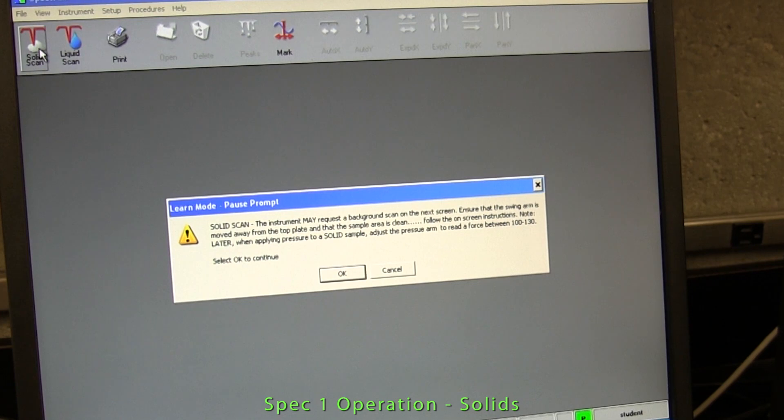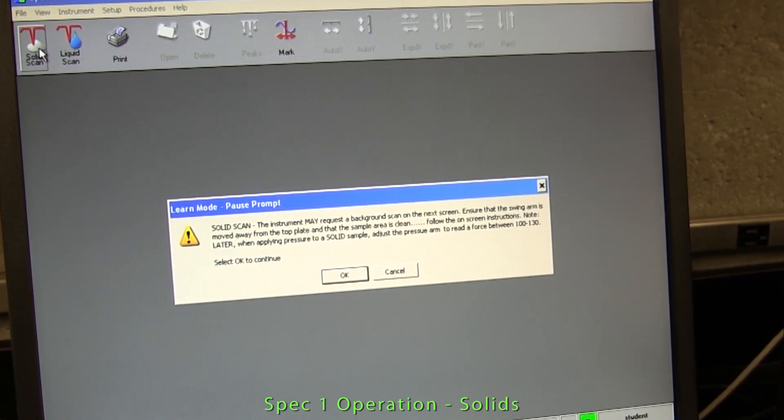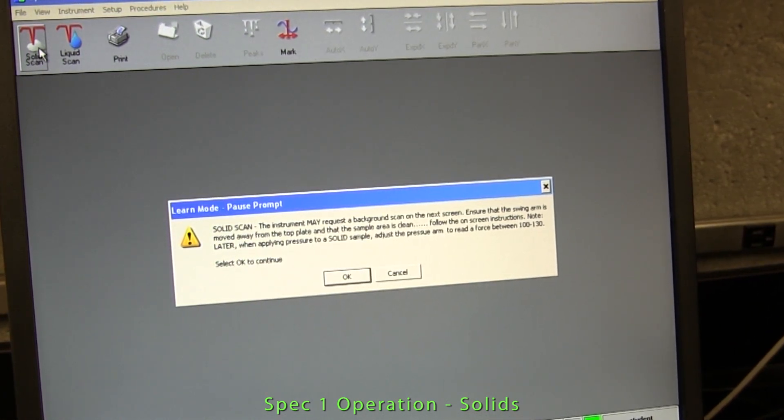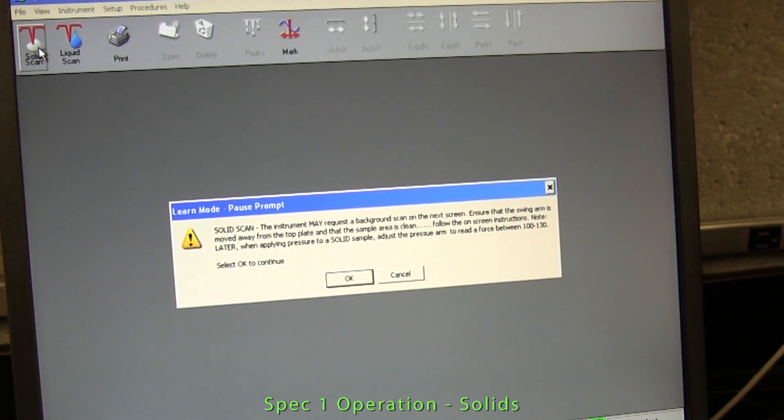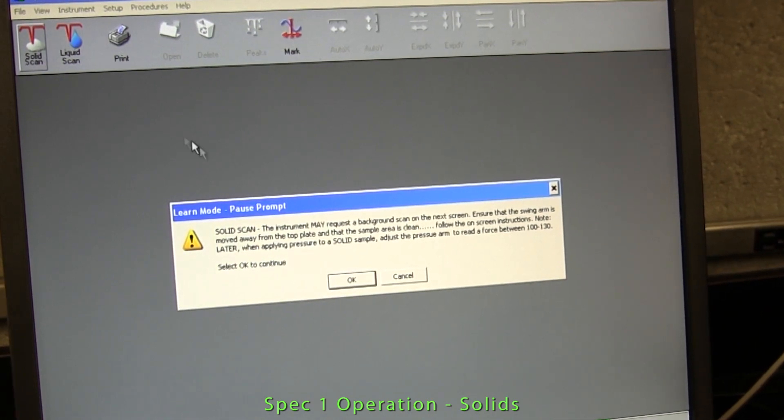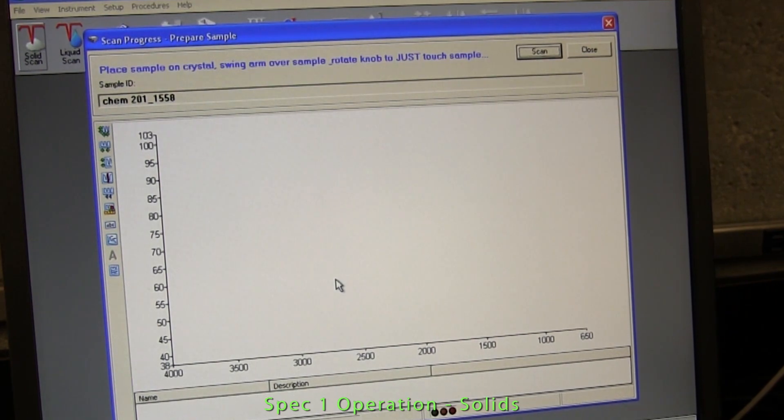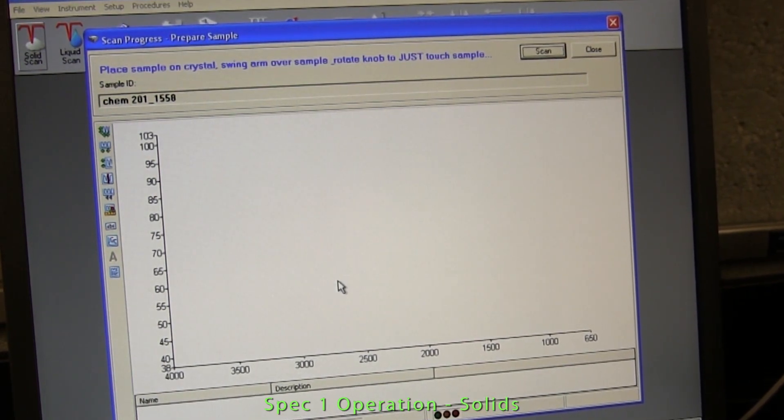So if someone else has used the instrument recently, it will use the already stored background spectrum. Just follow the on-screen prompt. Assuming that the background spectrum has already been stored, you will then be prompted to scan your sample.